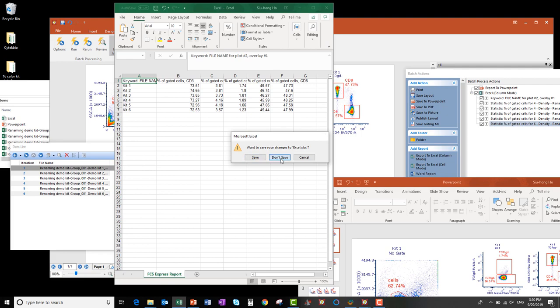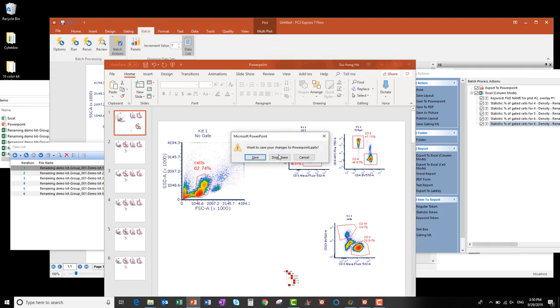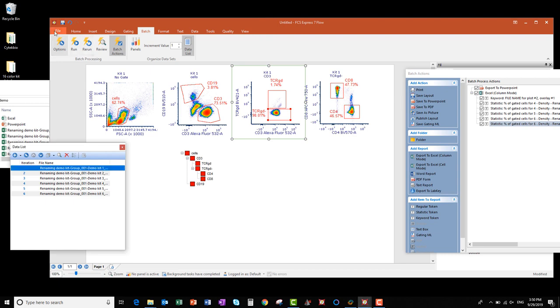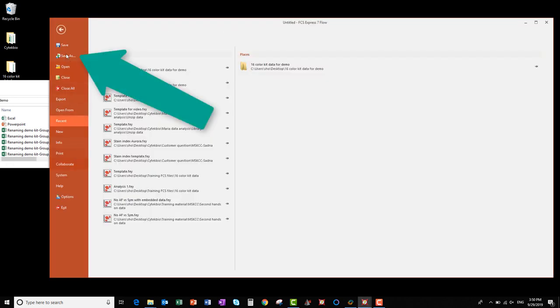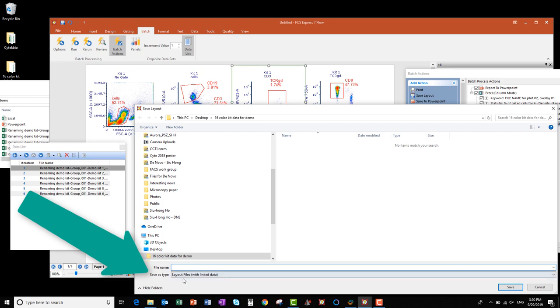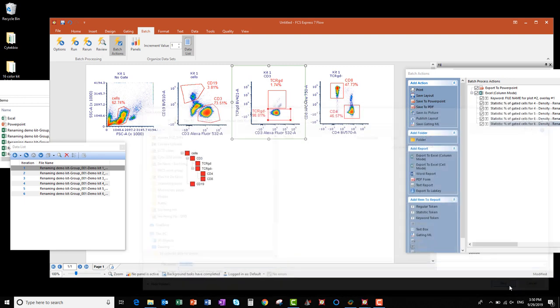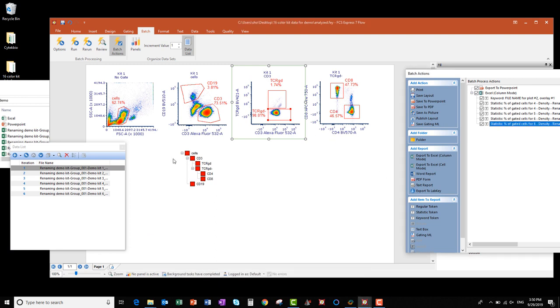Now let's close these files and save our work in FCS Express. First go to the File tab and click Save As. Set the Save As Type option to Layout Files with Linked Data and type in a name for the file. Here, I'll call this one Analyzed. Then click Save. If I reopen the FCS Express layout file later, it will remember the path links to each of my six FCS files and reload them with the layout.